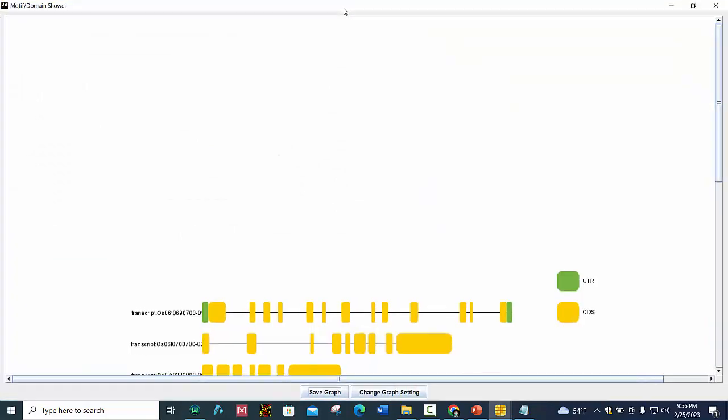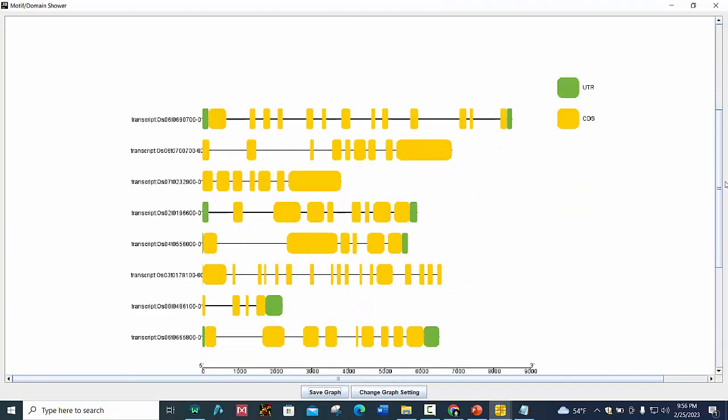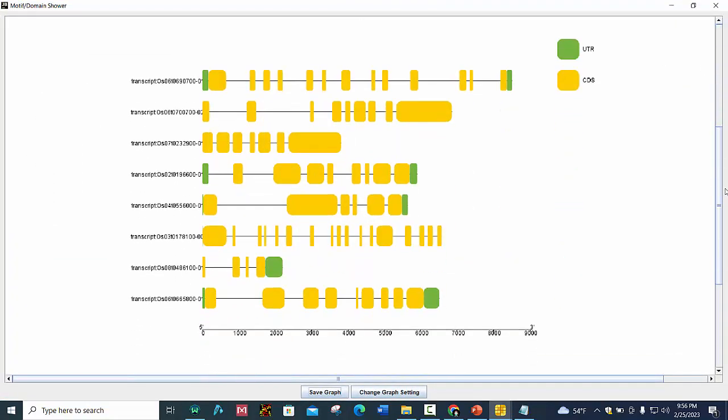Now you can see here is the gene structure. This green one are the UTR regions and this is CDS. You can also make your desired changes by clicking on Change Graph Setting.